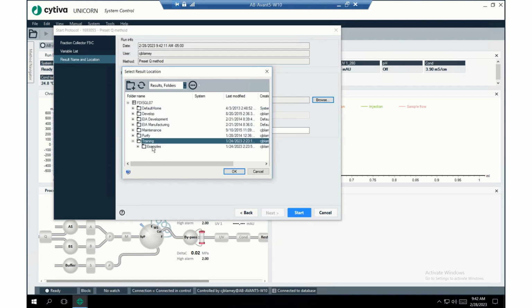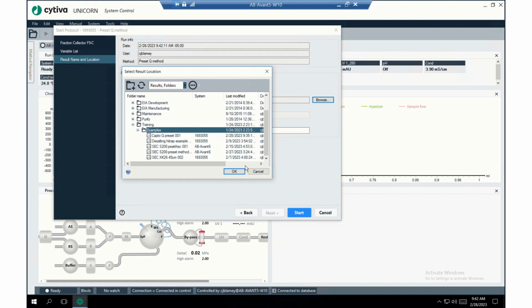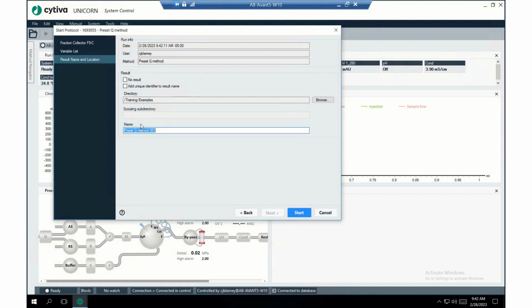Examples. Just select that. Alright, so we're going to call this Capto Q. Okay, there we go. We'll just hit start.